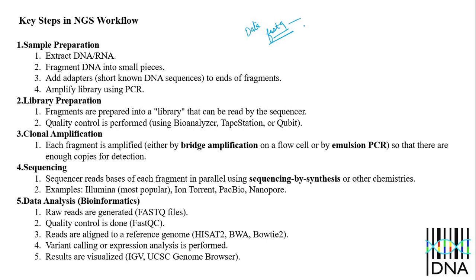Then we check the quality of this data with the help of software known as FastQC. Quality check by the help of FastQC.